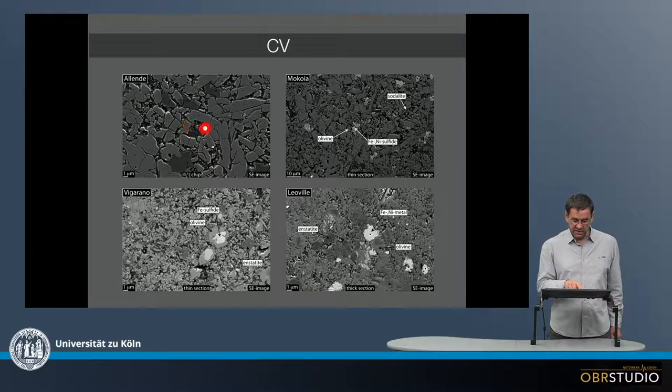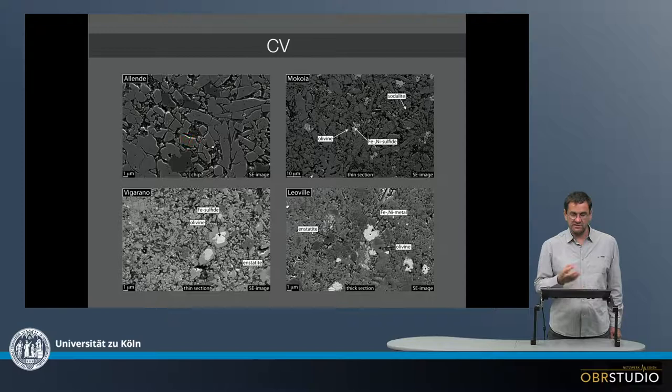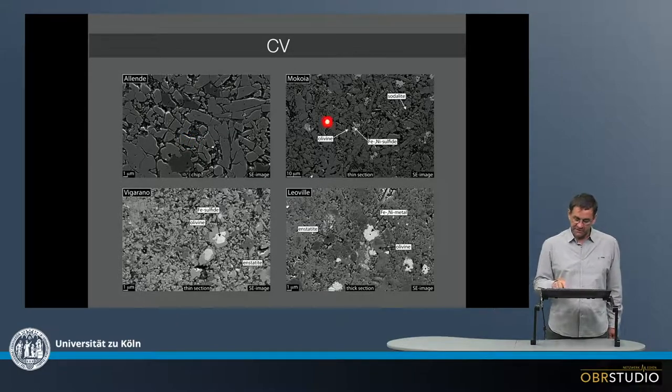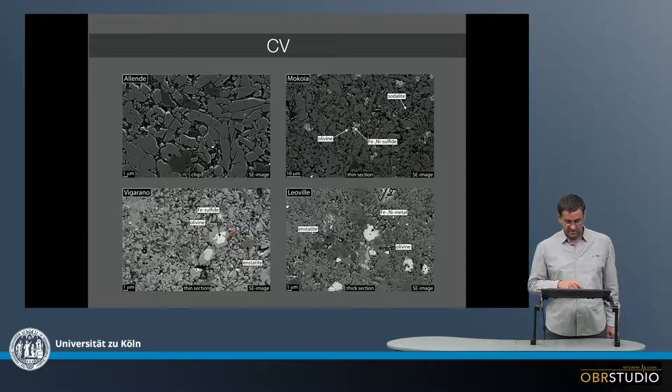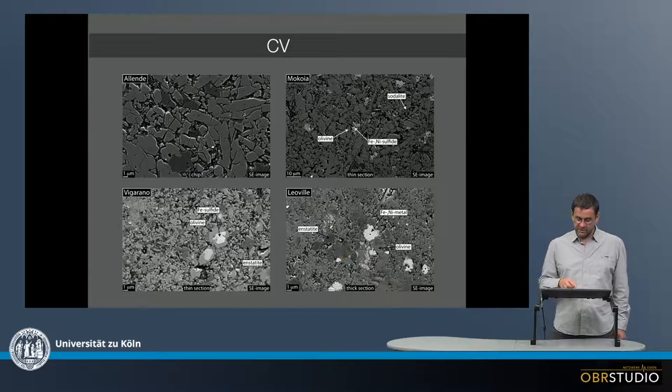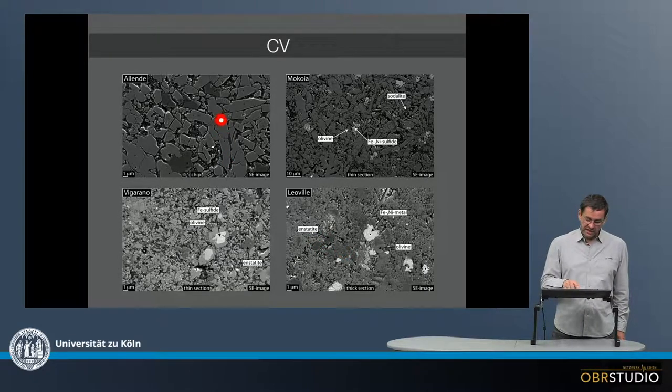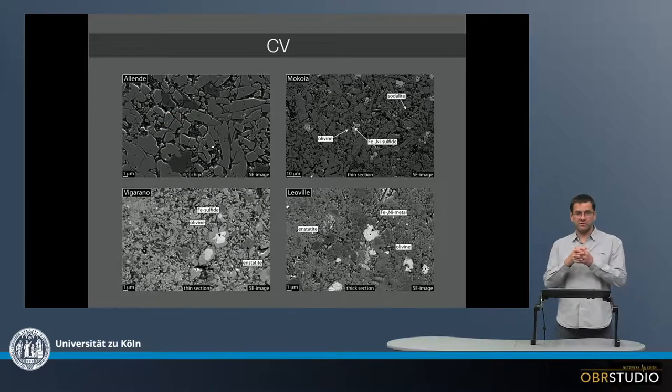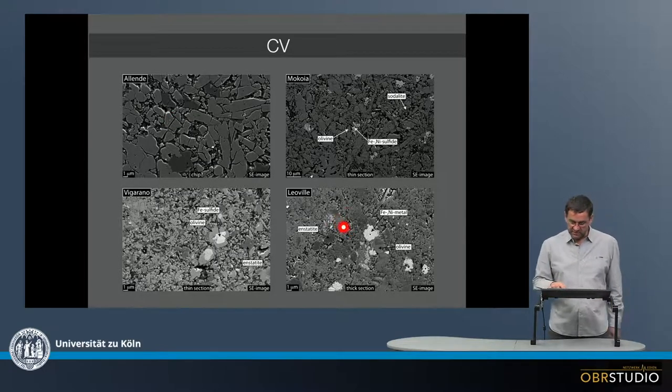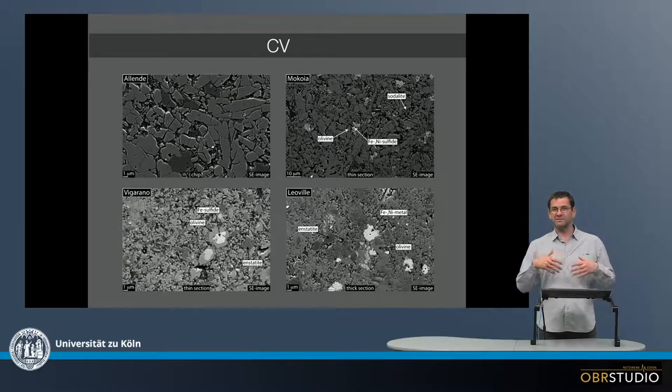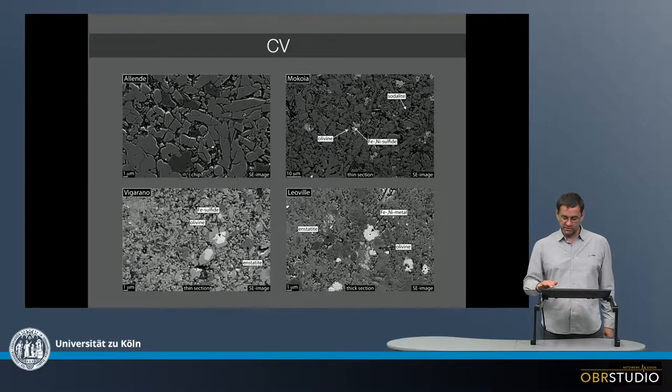Now in between, it's a little more harder to really know what it is, this is very fine-grained material, maybe in cases even amorphous. Similar is seen in Mokoya, so again this is olivine here, there's some iron nickel sulfide, or here in Vigarano there's some sulfide inside olivine, which is quite interesting. And in Leoville there's also some enstatite here in between. And you can see that sometimes the crystals have really a lot of space in between, so it really looks like an aggregation of smaller grains. In Leoville there's less space in between, so it's more compact, so this might be some overprint on the parent body.